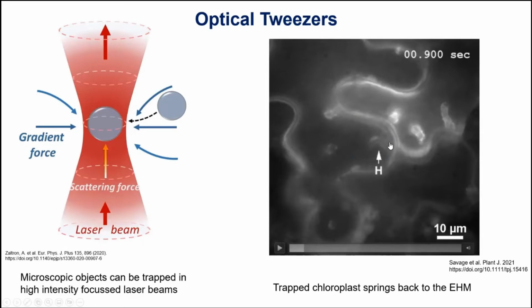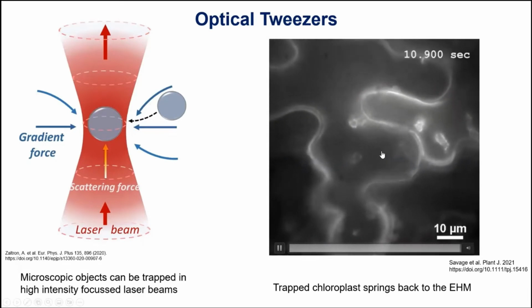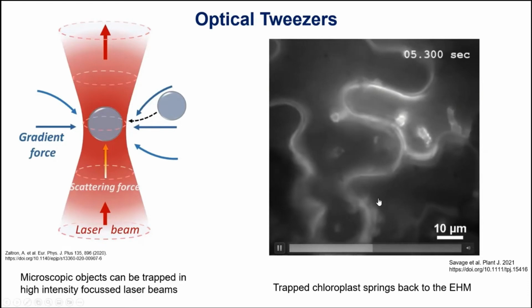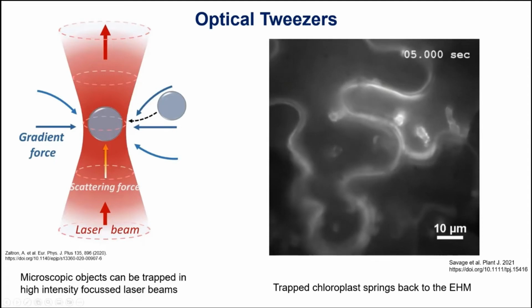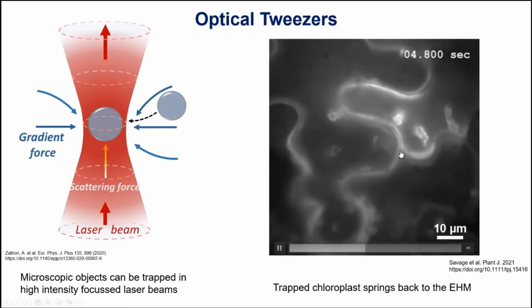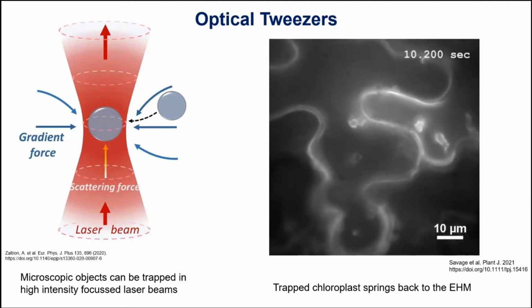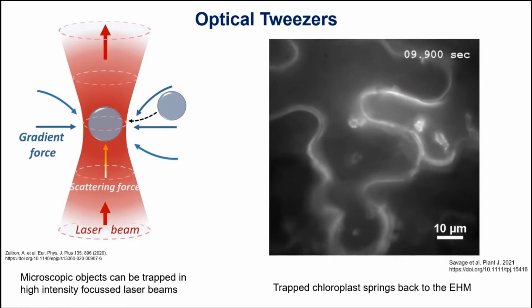So they're trying to work out the forces involved in attaching the chloroplast to the membrane. And if I let this run, what they did was try and drag the chloroplast away from the membrane and see what happens. So you'll see it move away, and then you'll see it spring back. And you'll see it again here. So what that's telling you is that the chloroplasts are in fact attached quite strongly to the membrane, strongly enough that the force of interaction can break the optical trap, and we can get quantitative measurements there of how strong interactions are between components within cells using this optical trapping technique.